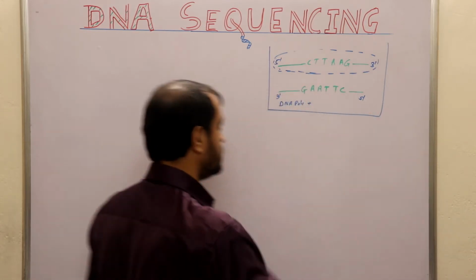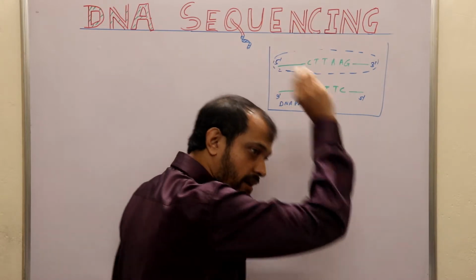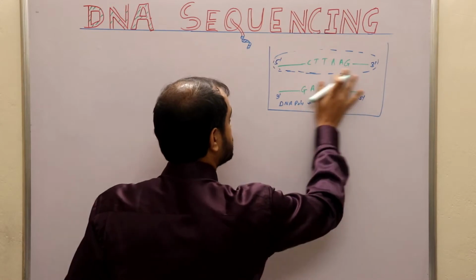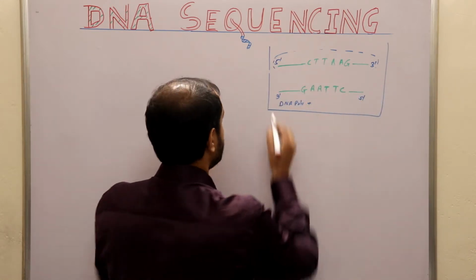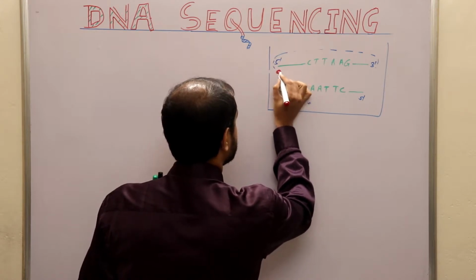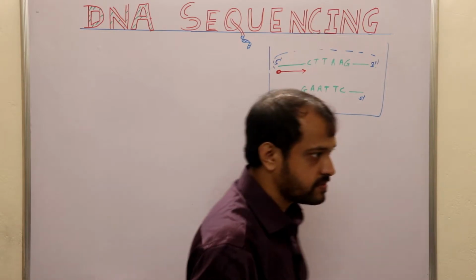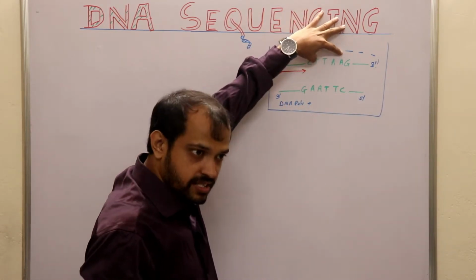I don't know how, but still, DNA polymerase, magnesium sulfate, and one primer, which will be ligated to this overhang sequence. Now listen, this is called overhang. That means this is our area of interest.